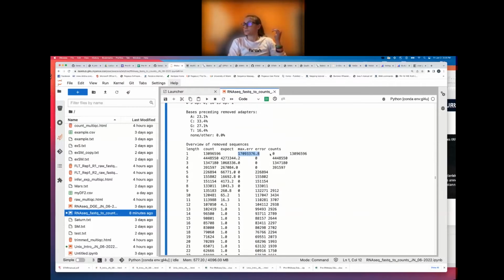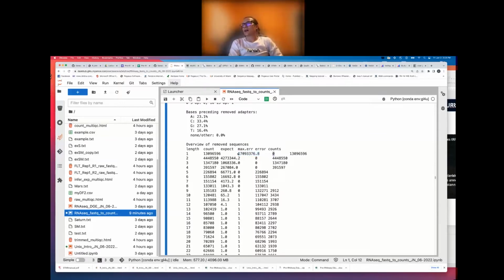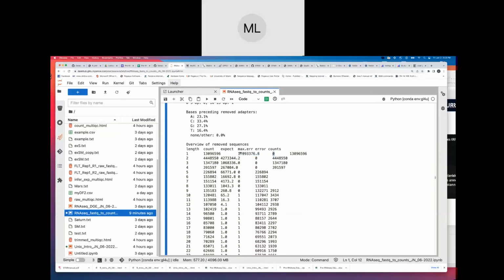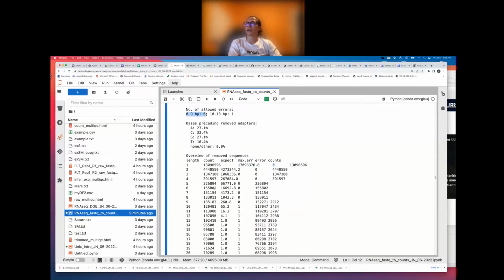I think that's just shifted over, Amanda, the zeros for your max error. Okay, that makes more sense. Yeah. That does happen though. Yeah. I was just reading it up. If there is a deletion, that will be weird. But yeah, thanks, Mike. So this is just tabbed over. Sorry. So this did have a 0, right? So really in your first 9 base pairs, we don't allow any errors. So those really should all be 0 unless there's a deletion that's detected. So it's smart enough to know if there's a deletion or not.